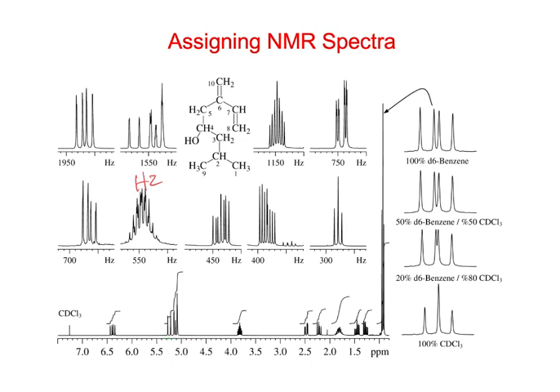We probably have these 2 on the end of the double bond here, and we have 2 that are on the end of the double bond over here as well. Okay. Right? And so we have all these double bond protons that are all going to be above 5. All right, so out of those, we have 2, 3, 4, 5 protons on the double bonds. We have 1 proton signal here that stands out all by itself. Which one do you think that will be?